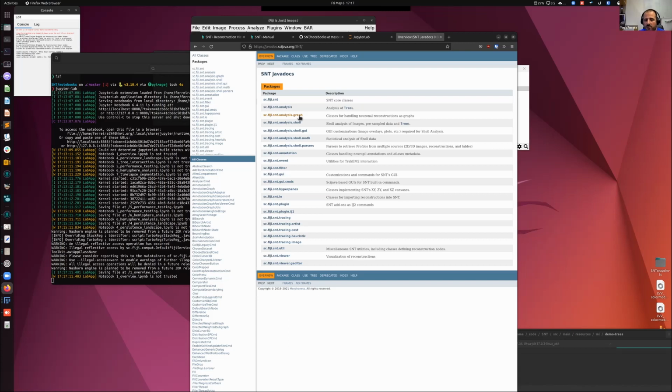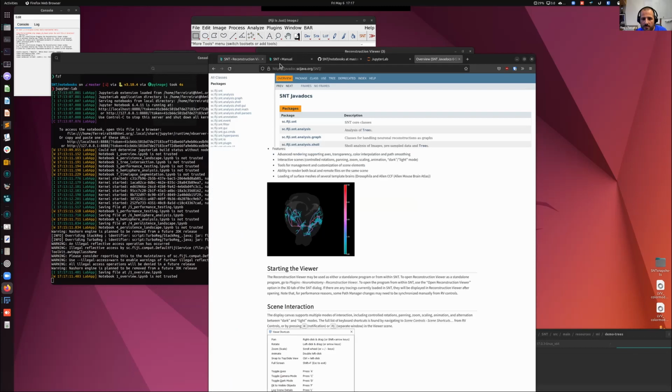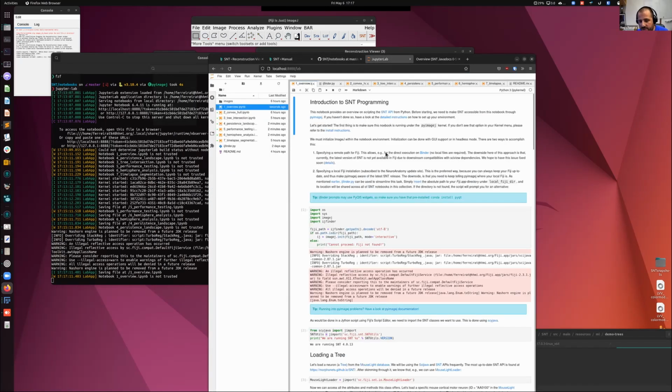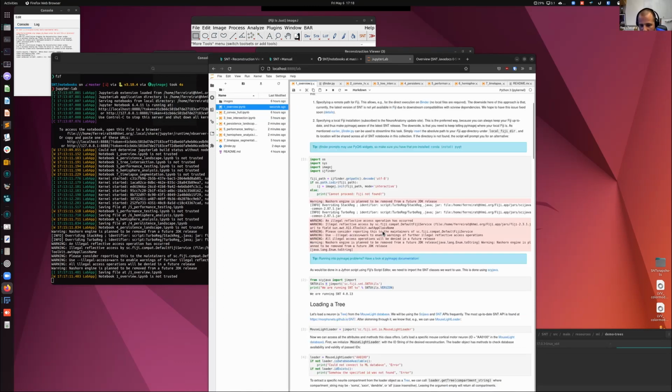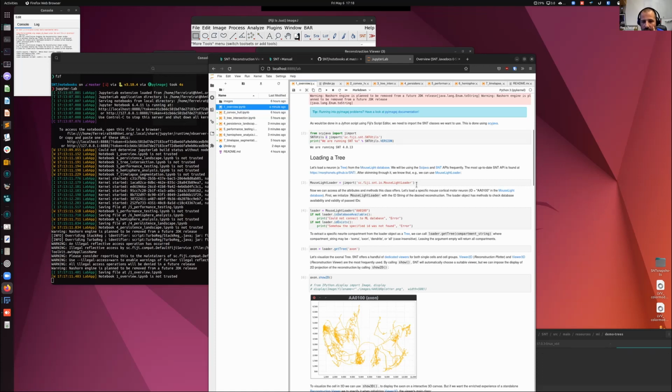Here is everything related to the graph theory aspect of the analysis, and so on, and GUI and tracing and so on. SNTUtils, in this case, is just a convenience class that offers convenience methods to some of the most common or debugging functions of SNT.